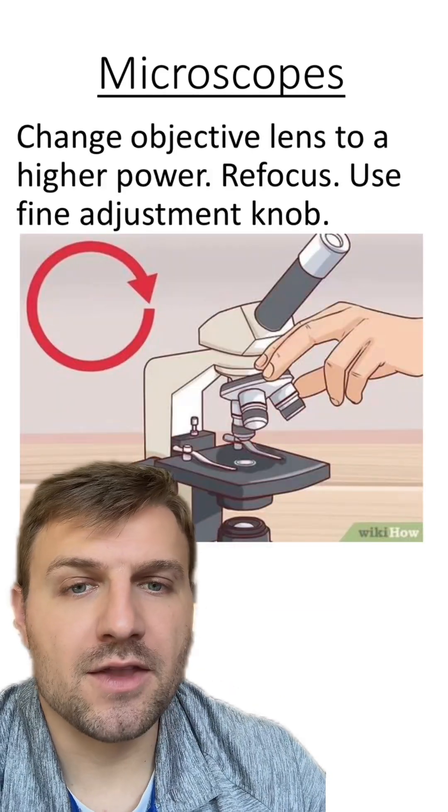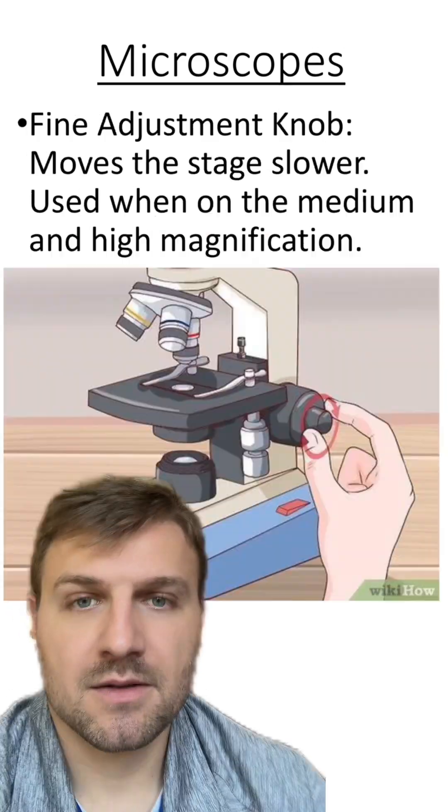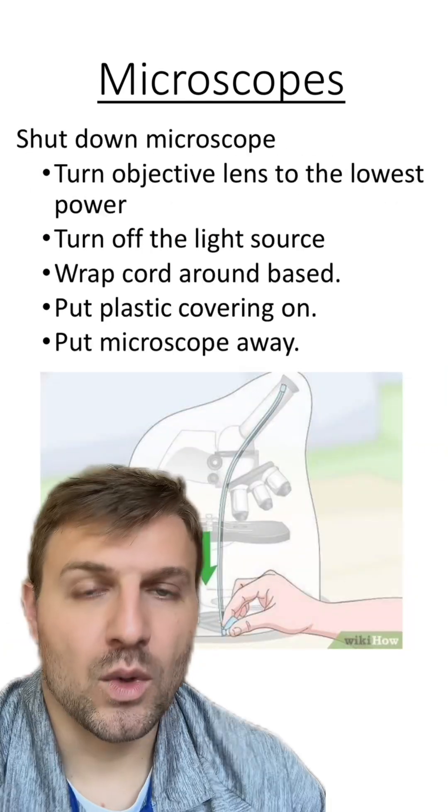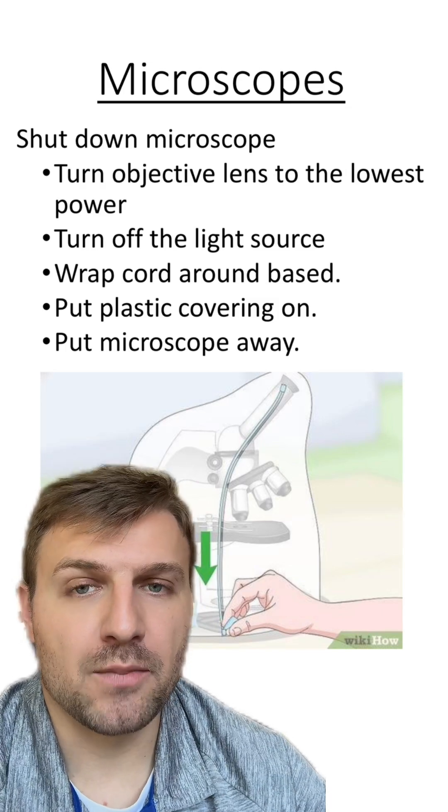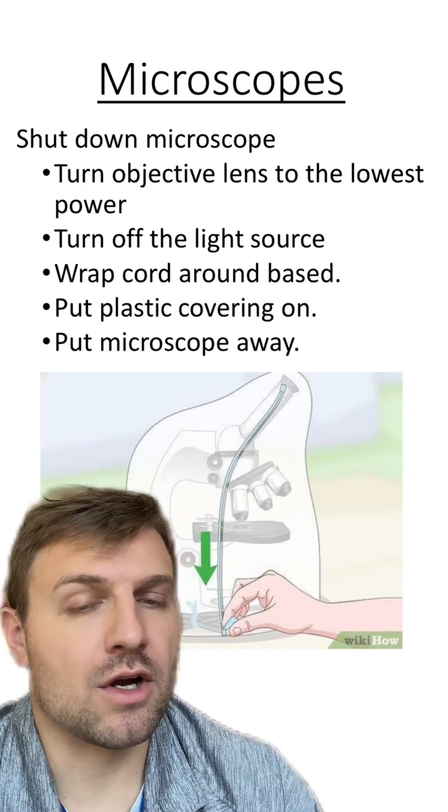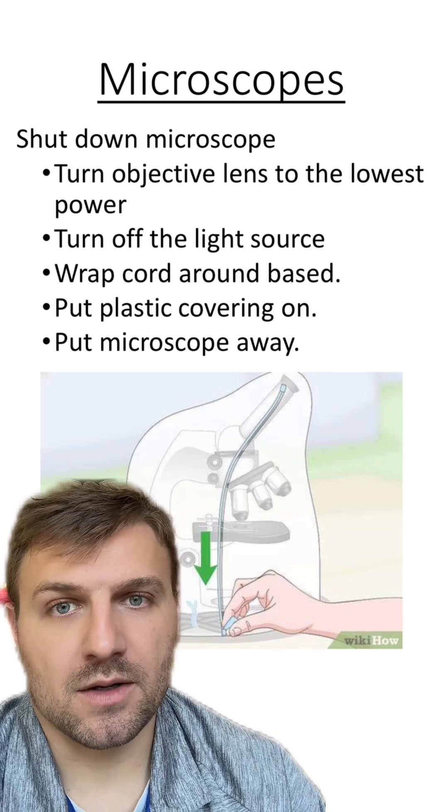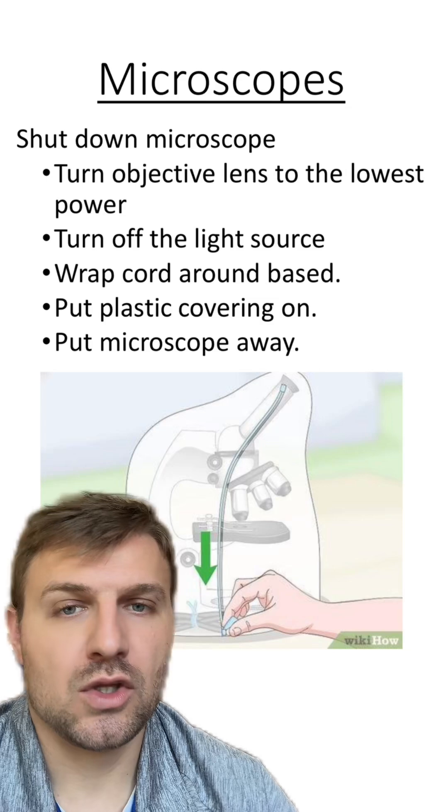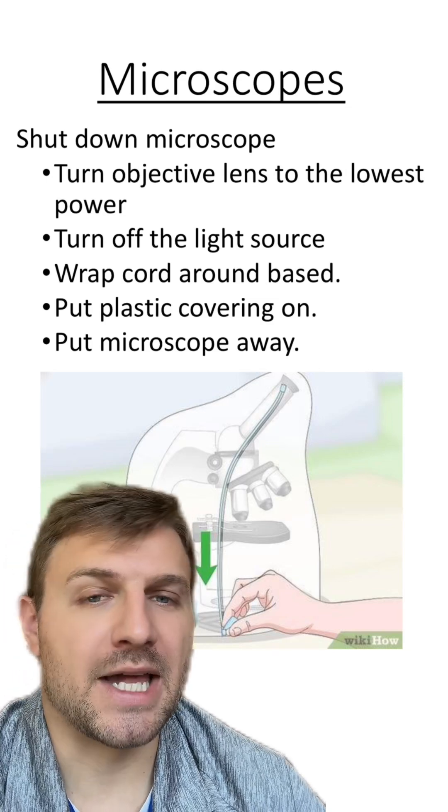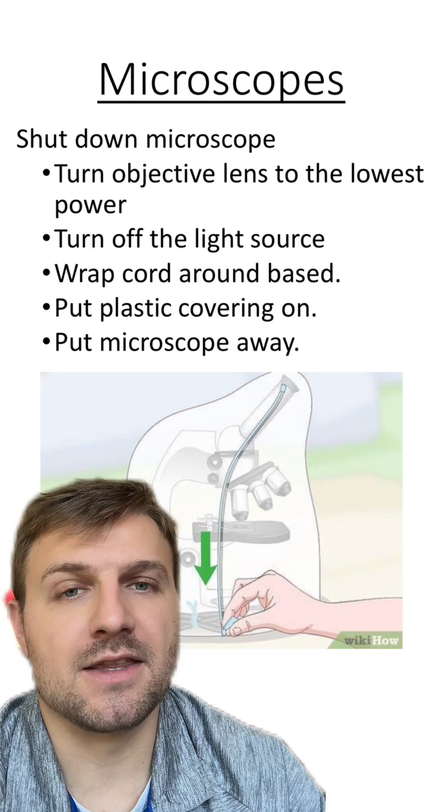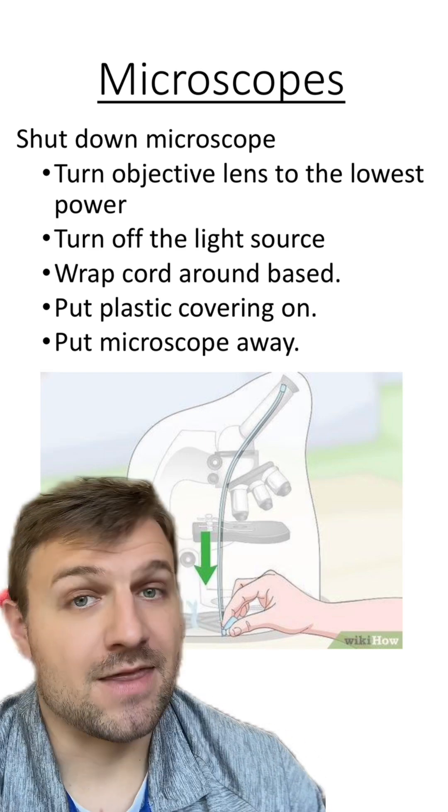After refocusing it on the medium objective lens, you're going to move up to the highest objective lens and refocus it once again. When you're done using the microscopes, you have to make sure to put it away properly. First, you turn the objective lens to the lowest power. Next, you turn off your light source. You wrap the cord around the base and put the plastic covering on it and make sure you place it in the correct location. And that's how you use a microscope.